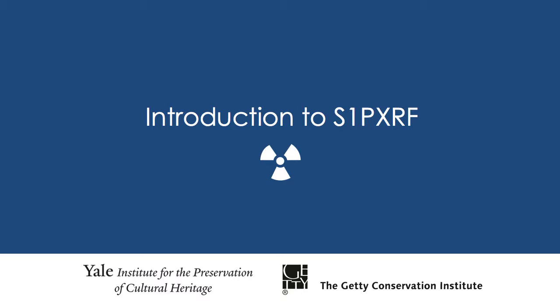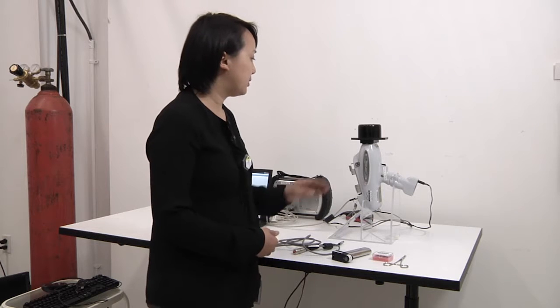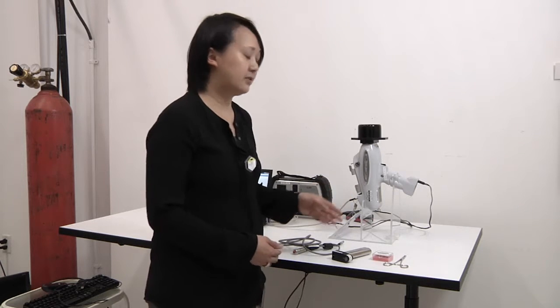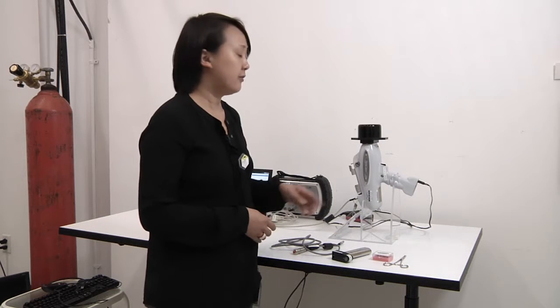So in this section we will be turning on the instrument and using the S1PXRF software to control the instrument. As a quick review, I'd like to remind the audience that there are three ways to activate the x-ray tube.